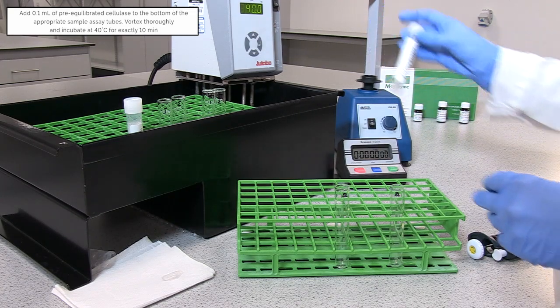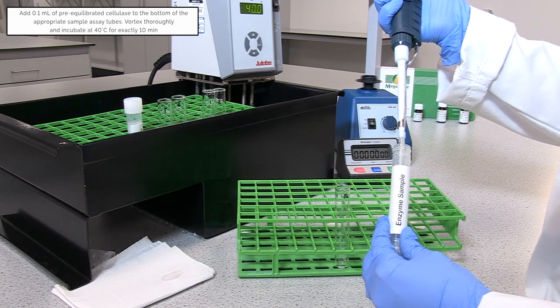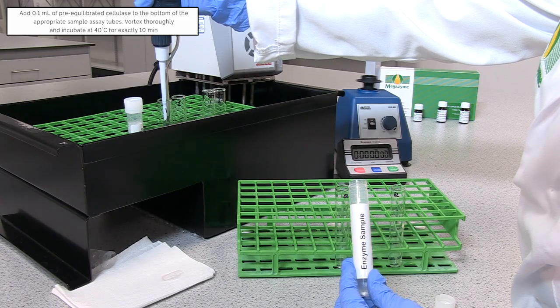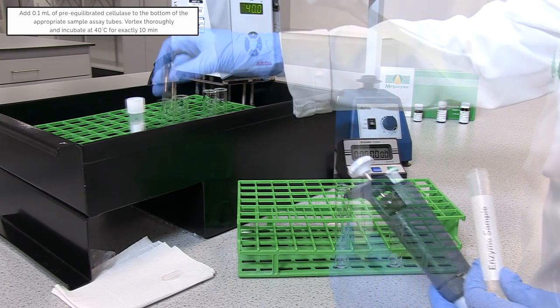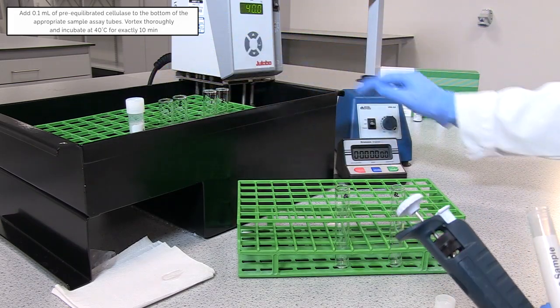To each tube containing Cell G5 reagent solution, add 0.1 millilitres of cellulase dilution to the bottom of the tube. Stir on a vortex and incubate for exactly 10 minutes.